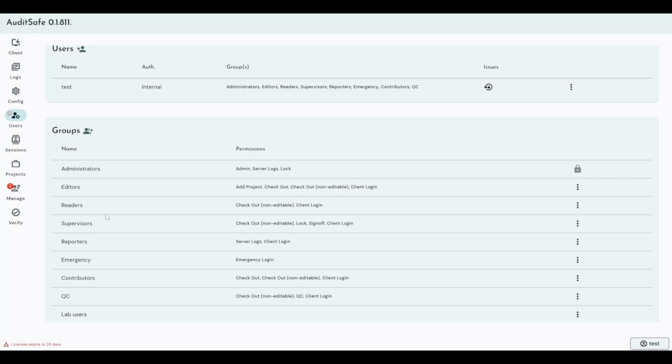If you come along and add the other 90 people to the readers group, well, from that, you already know exactly what permissions all 90 of those people have got. So it's a great way of automatically applying permissions for access to projects to a large number of people, and then being able to understand what permissions everyone has simply by knowing what group they're in. So it makes stratification of users on site, especially when you've got a large number of users, much, much easier.